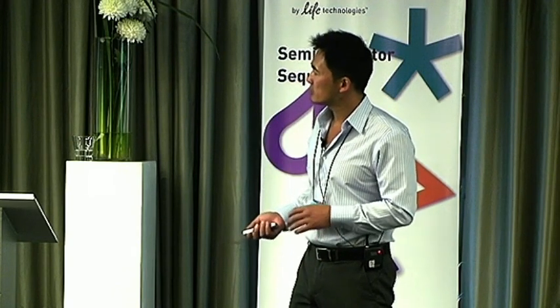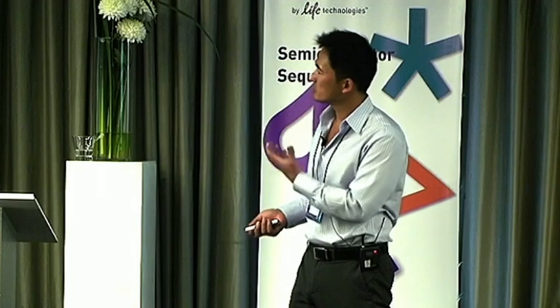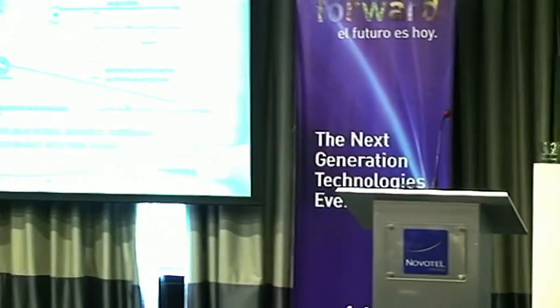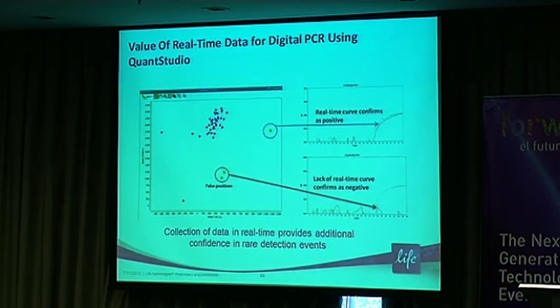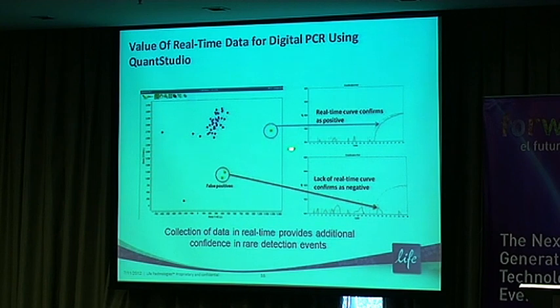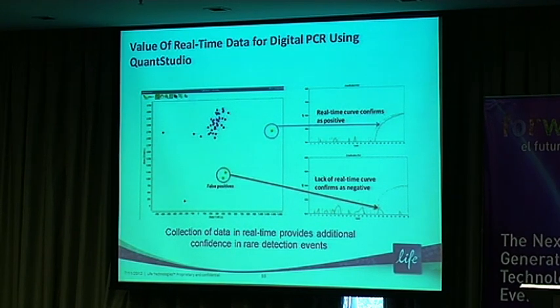So by using that approach, we can use digital PCR together and couple it with a genotyping run, or a gene expression run, right? We can go back and say, okay, not only do we get an endpoint analysis, we're trying to determine what these miscalls or off calls are. Is this really a different allelic variant?